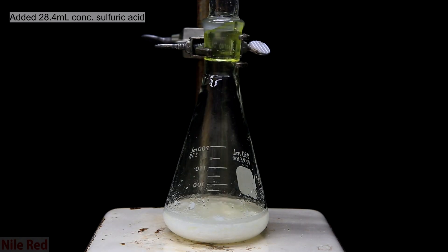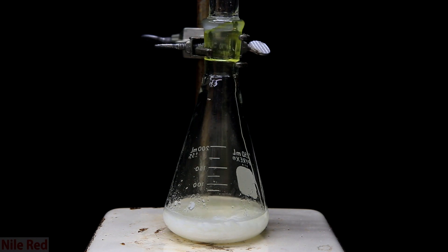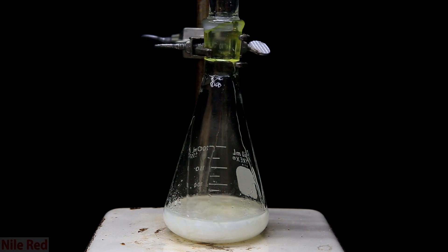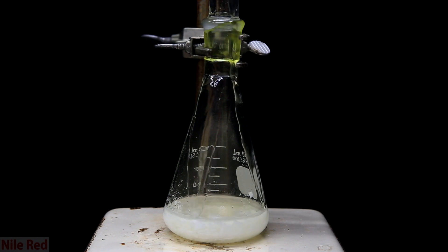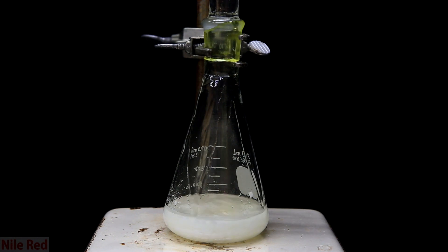Once it's all added, I let it stir for a bit and then I slowly add in 28.4 milliliters of concentrated sulfuric acid. The addition of the sulfuric acid is pretty exothermic, so it should be added as slowly as possible. After it's all been added, the solution at this point should be pretty hot.